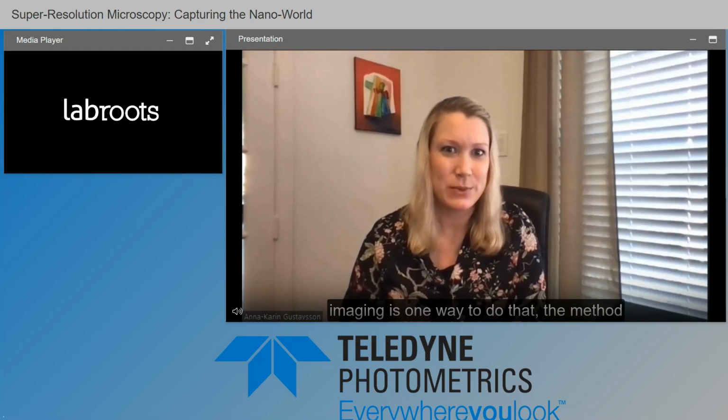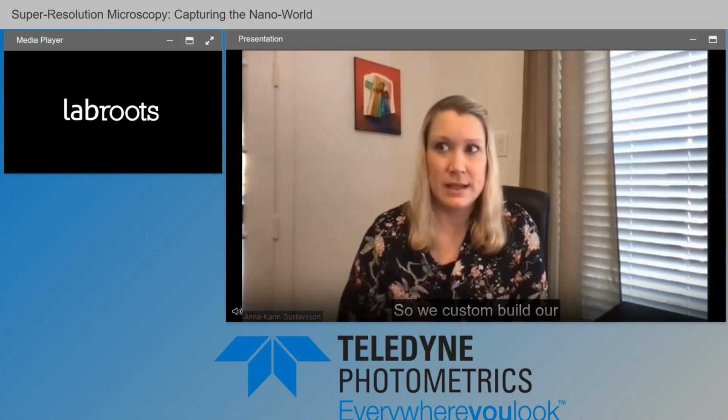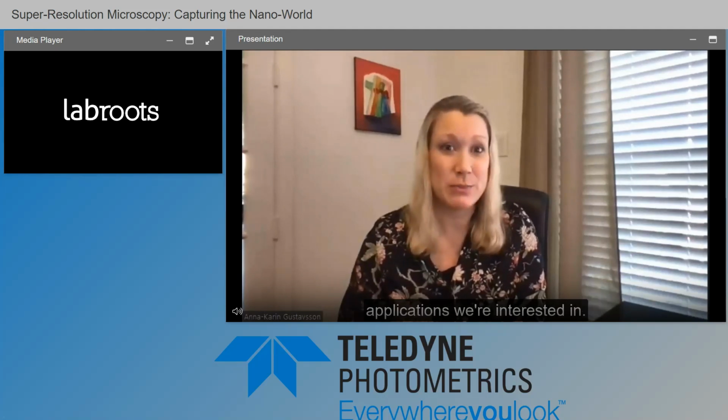That is the method that we are using mostly in our lab. So we custom build our microscope, more or less. We start with a conventional microscope base, but then we add different modules and functionalities depending on what developments we're working on to improve the techniques and what applications we're interested in.